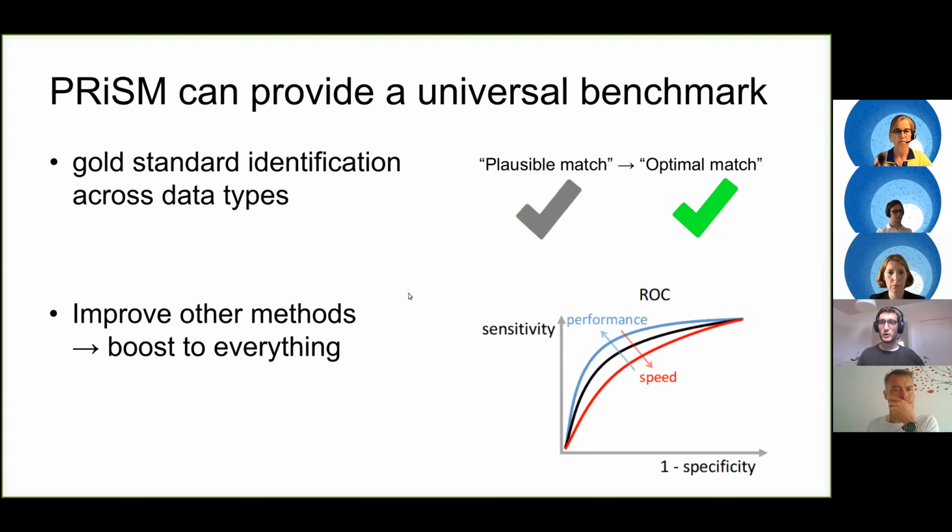Because now, when you develop a very fast identification algorithm that is industry worthy, let's say, in the past you were never really sure, when you used a heuristic or a shortcut to be fast enough, what its impact would be on the quality of your output. You know that it's faster, but what about the sensitivity?